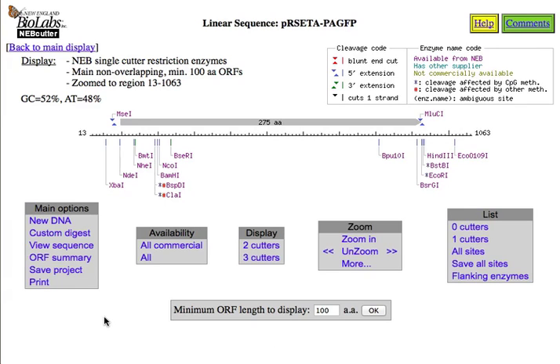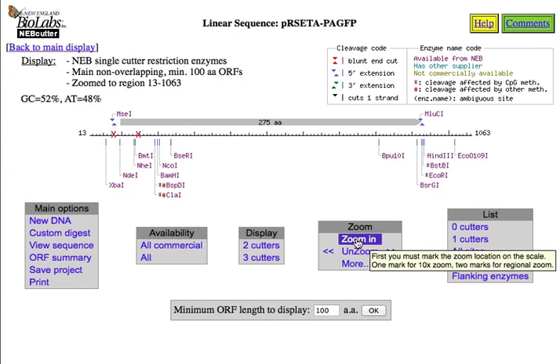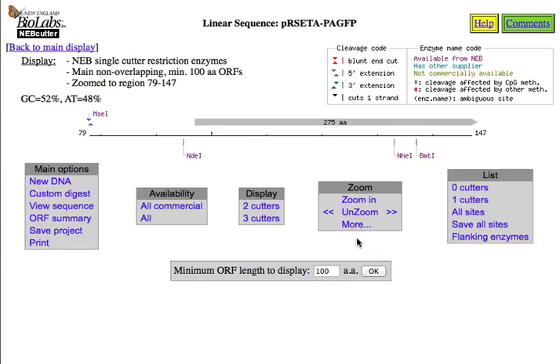So in the lab, in real life, sometimes you clone in both places if possible, and see which one is expressed better, which one has the brighter fluorescence, which one is the best function, etc. You have to determine that empirically. For our example today, let's examine in more detail the N-terminus, which is here, and then also the C-terminus to look for appropriate restriction sites.